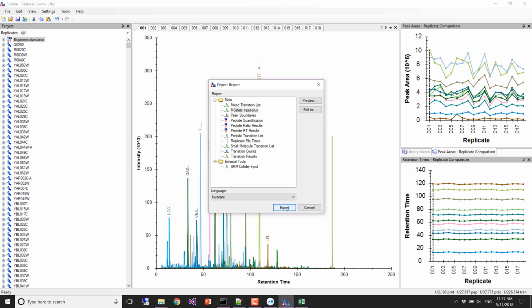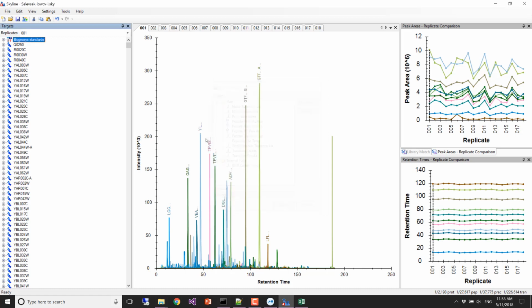And maybe, actually, let's just go by that. So let's skip that step because I have all the reports exported. So you're going to be able to get those reports to work with Mina. And we can maybe leave one report exporting when we go to lunch, and then people can see that it will complete. But it takes a little bit of time with these big documents.